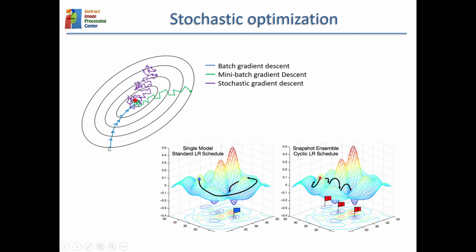So let's say that you start from here and you want to find the optimum of this function here. So there is a valley at this point. The deterministic optimization, one of the most famous ones, is gradient descent. So a gradient descent goes in the direction where the slope is maximum. So you go through the direction of the maximum slope and then you find the minimum. But this is very good for local minima.